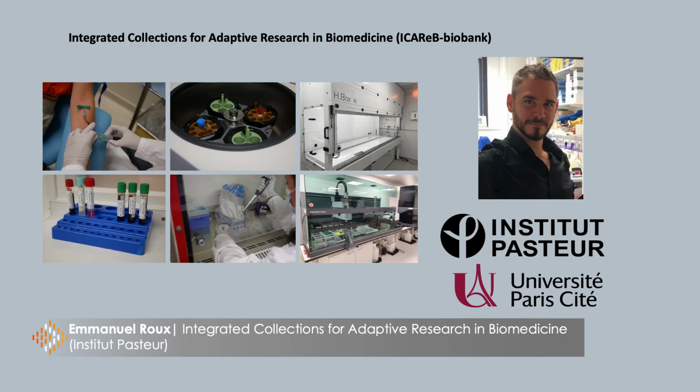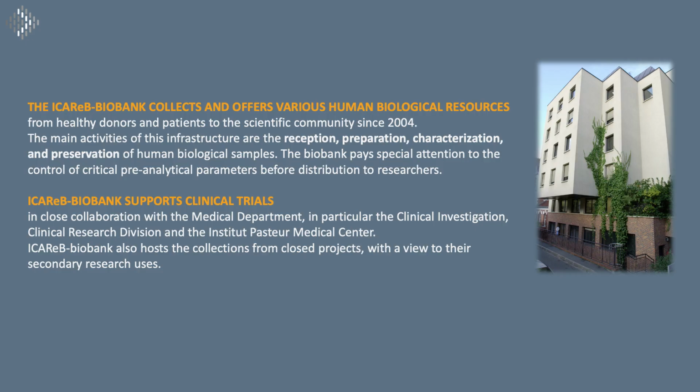Thank you. My name is Emmanuel Roux. I am the head of the CRBIP Biobank unit. The purpose of this unit is to ensure the management of human biospecimens collected either from healthy volunteers or from patients, in the context of specific clinical trials, but also in the context of open collections. We then speak of collections of human samples.